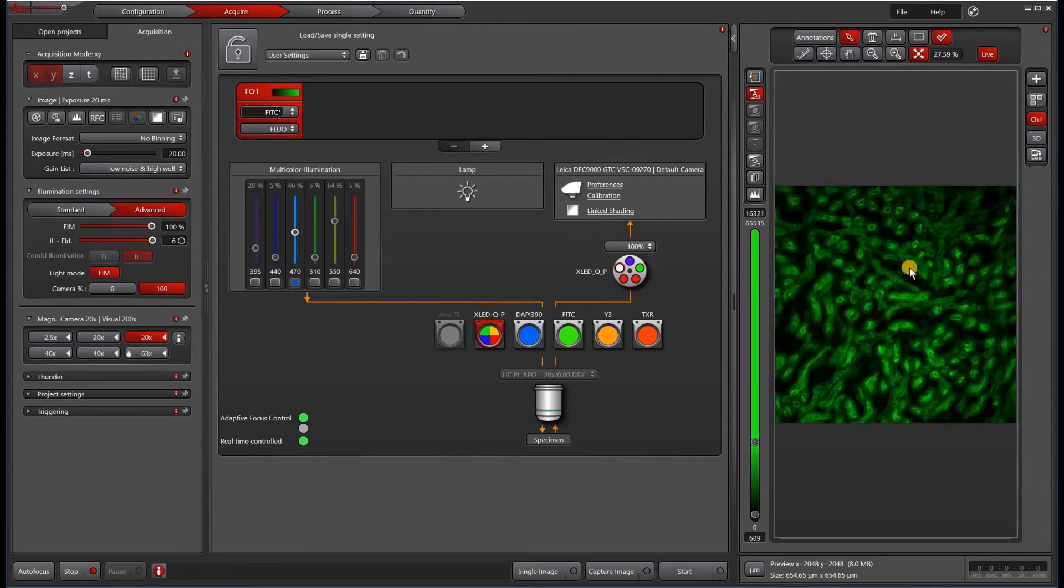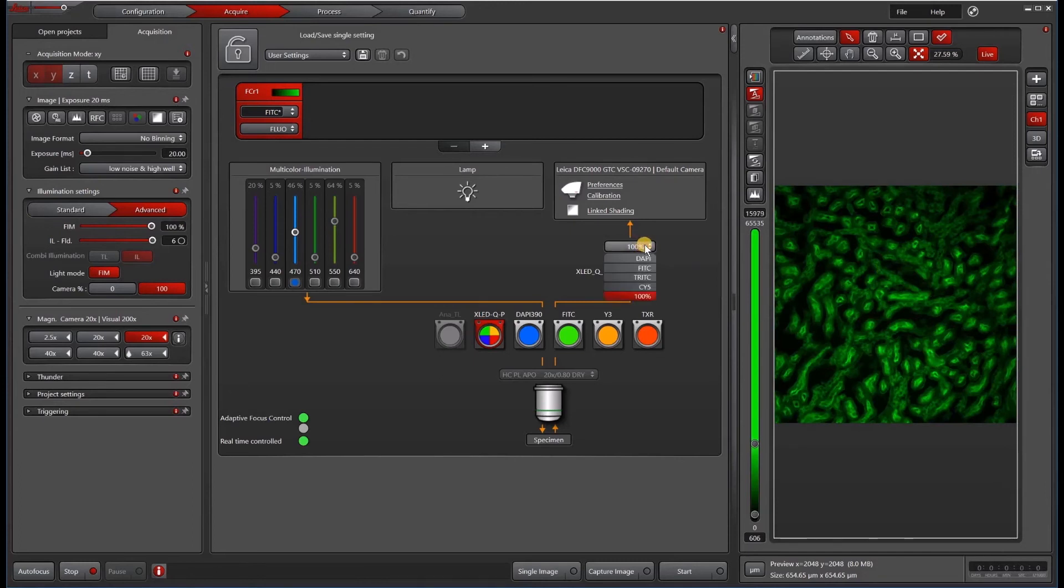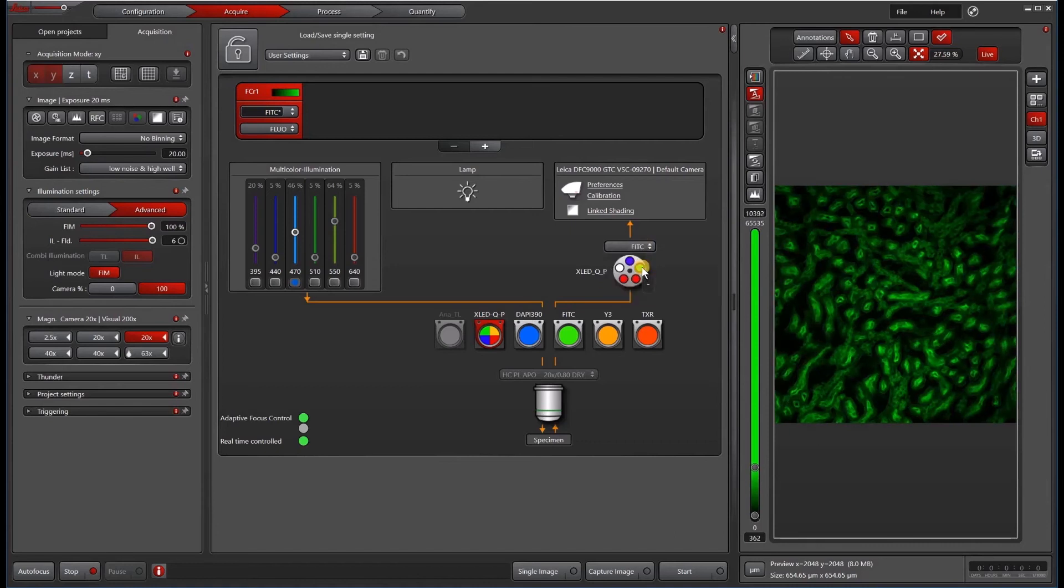This is what it looks like with 100% of the light passing through. Now, if you really want to prevent crosstalk, we highly recommend you choose the FITC channel. This will cut down on any crosstalk because it will add another bandpass filter in the emission light path.